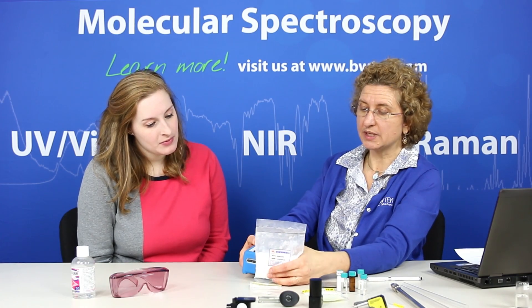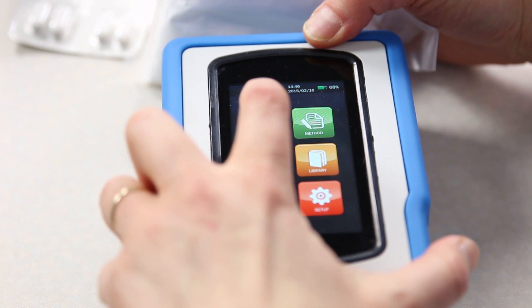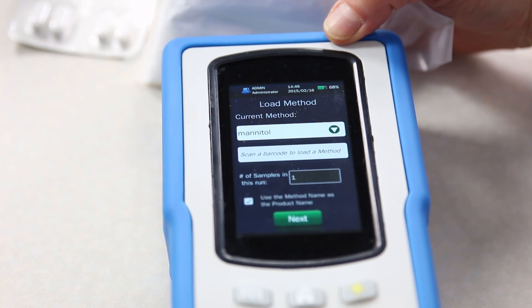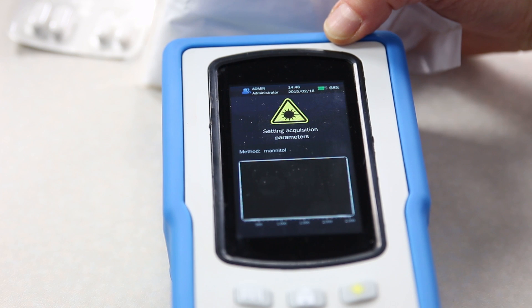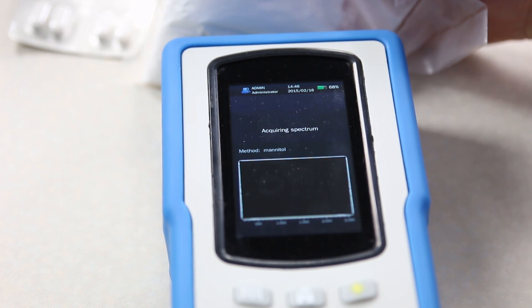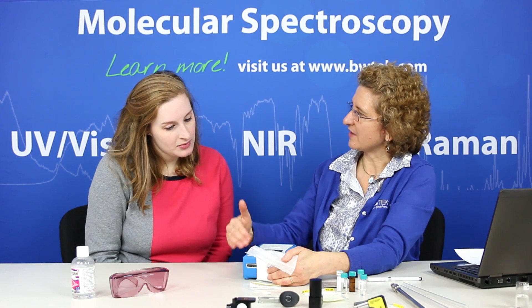Take for instance this sample here, which is mannitol in a plastic bag. With the point-and-shoot adapter we can press this up against it, and in our identification mode we can make a measurement to then see and verify the identity of this material. So I choose the method of mannitol and then make my measurement, where it's going to be compared with the method and verify that the spectrum matches what the method was based on. We'll get a rapid pass/fail result.